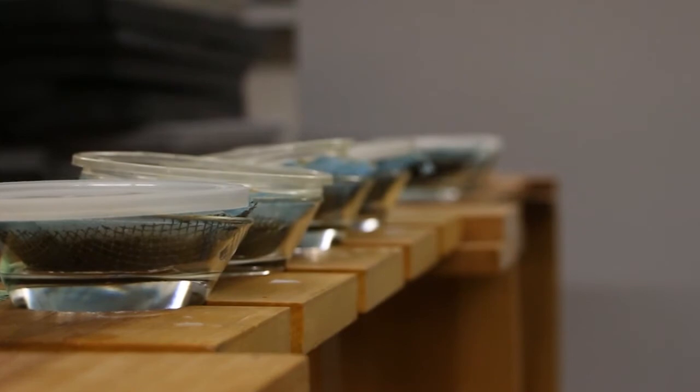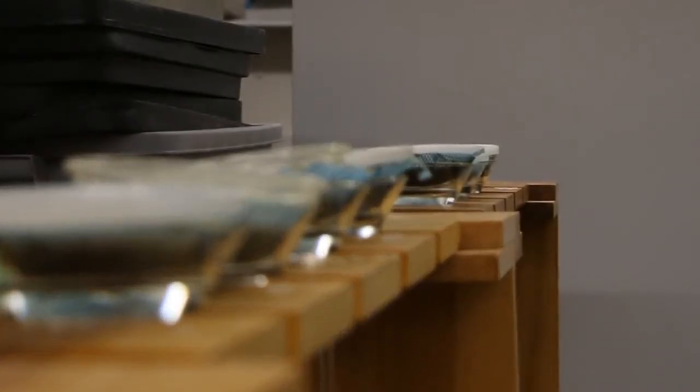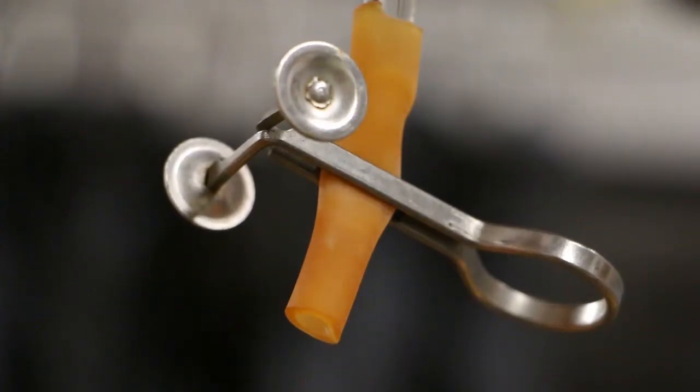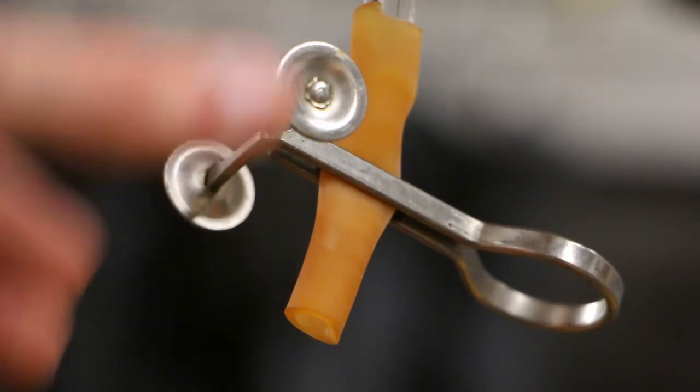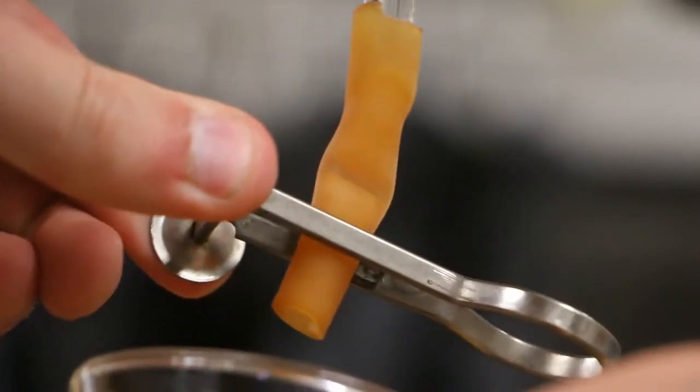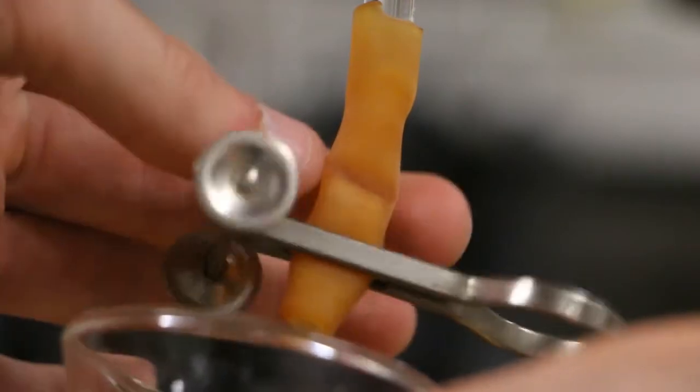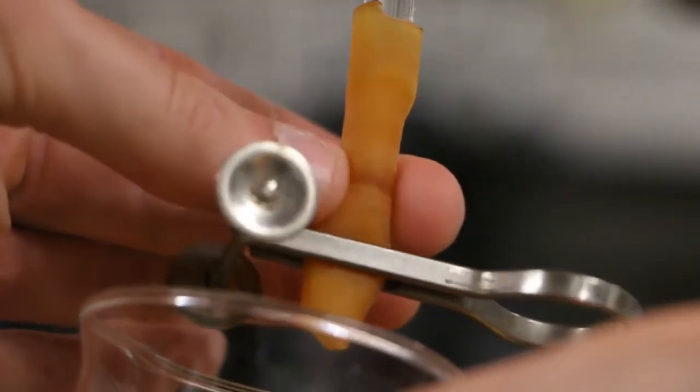Once the funnels have sat overnight, they're ready to be tapped. Undo the clamp and let about 20 milliliters of water through. If the tube gets pinched, use your fingers to gently prod it open. But remember, there are nematodes there, and you don't want to squish anybody.